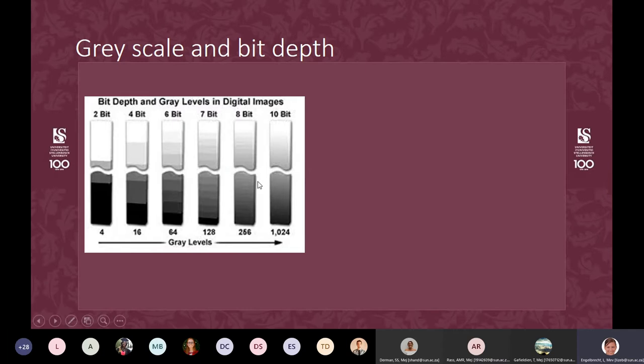Most confocals, or most of the images that we work with, have 8-bit PMTs, or cameras, which means that if there's a small difference, at least those values of the pixels will change. If you had your control cells here and the treatment caused a little bit of an increase, you will be able to see that as a numerical change. Of course, the more and more bits you have, the more changes you'll have. But at some point, it becomes irrelevant. Also because of biology and normal variation or variability, small changes might also just not be worthwhile. So 8-bit is a very useful number.